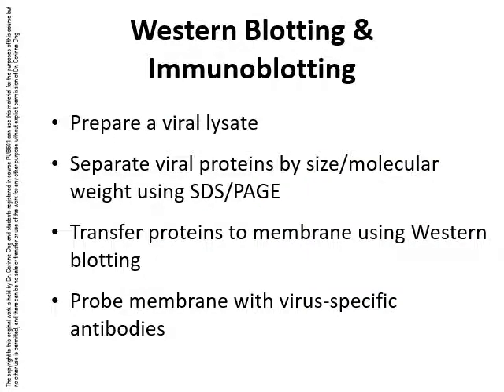To analyze viral proteins, virus cultures are lysed and separated by SDS-PAGE. They can be visualized by staining the polyacrylamide gel using protein stains. However, because most viral lysates also contain mammalian cell proteins that are used in their culture, immunoblotting is usually performed after the initial electrophoresis to detect viral antigens using specific antibodies. Immunoblotting is also used for detecting antibodies to viral antigens.